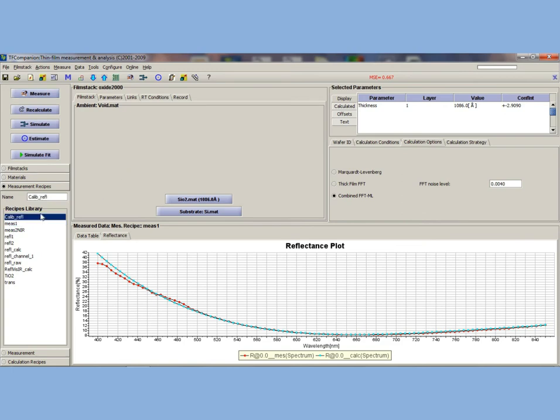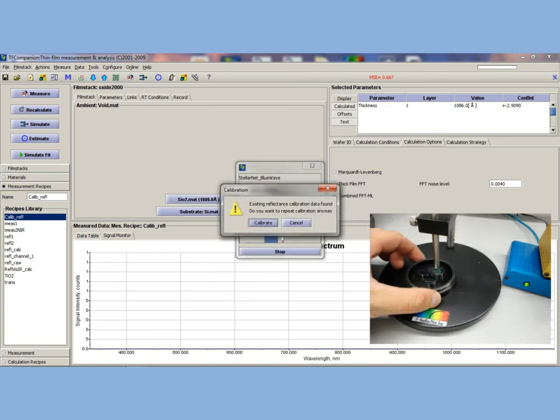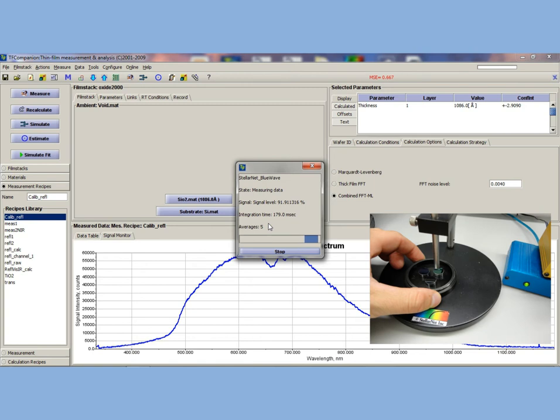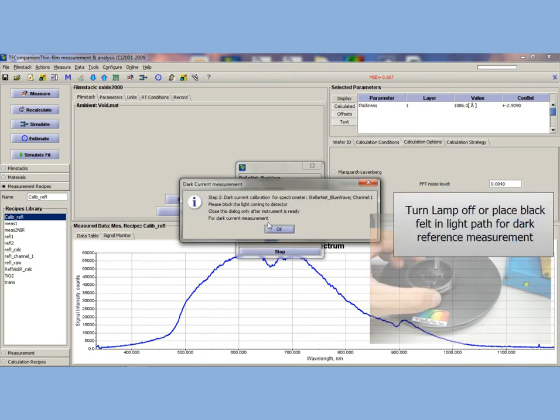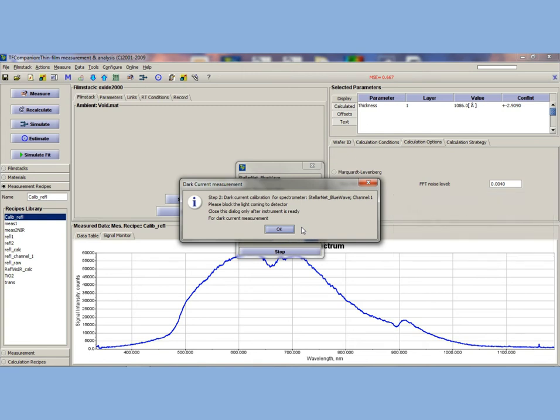Now we would like to take a reference using the silicon reference standard. Place the check sample under the reflectance probe and click on measure. We have selected a calibration recipe — click OK. It will prompt you to first take the spectrum and then take a dark current calibration. Click OK.